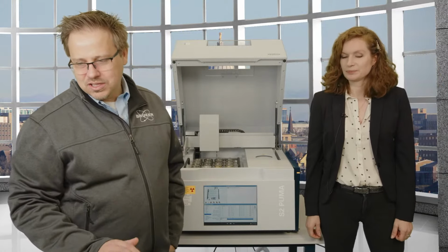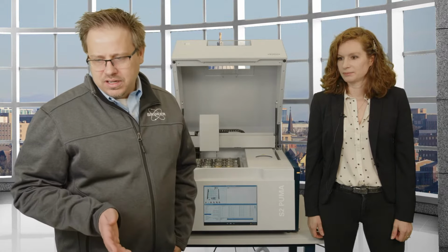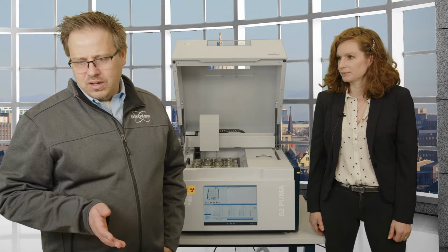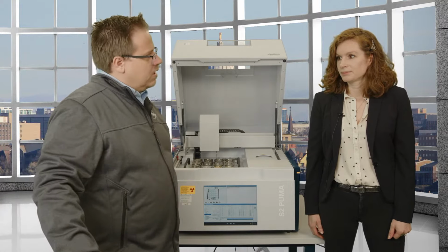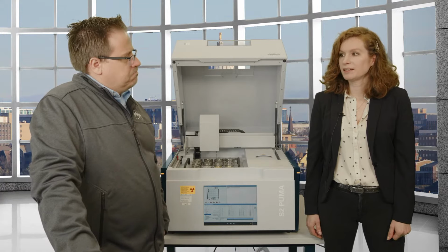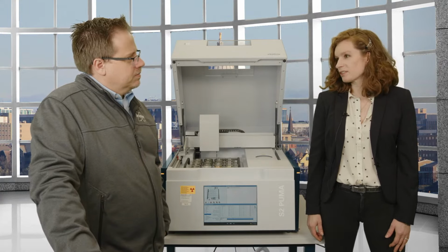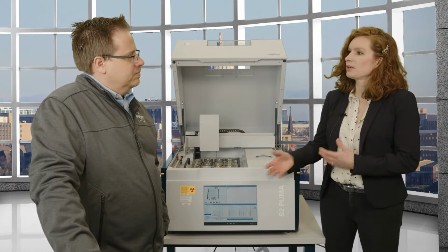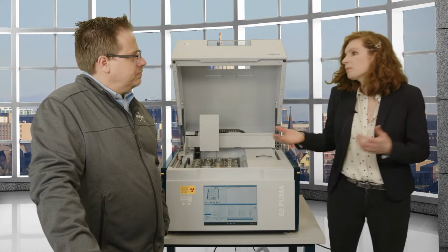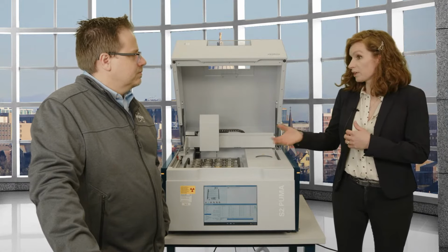All right, so the next question is from Molly. Are there any branches that are not using XRF? Where would it make a lot of sense? I think XRF is used pretty much everywhere. It just depends on the degree, right? The plastic industry is using XRF, but they could maybe use it more. The feed and food industry, as I just said, is working on it.